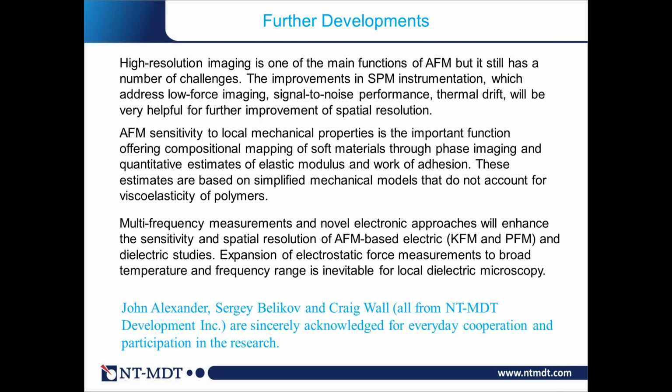However, still people do a lot of imaging and mechanics. Of course, mechanics on soft materials is very difficult because sharp and stiff tips are not acceptable, because you will penetrate the cells and bring damage and so on. If I were to start from the beginning, I would use relatively dull tips with beads that we can look at to evaluate the dimensions, because we need that to extract any quantitative information from deformation. We have knowledge about that.